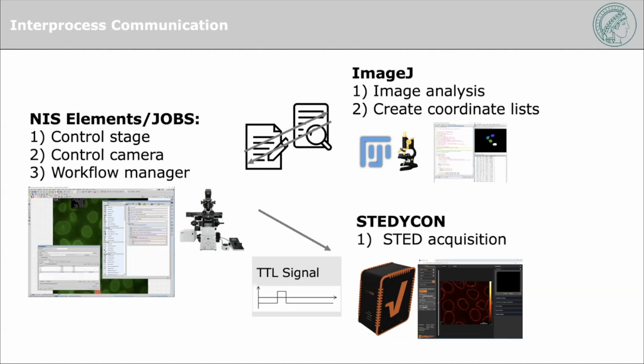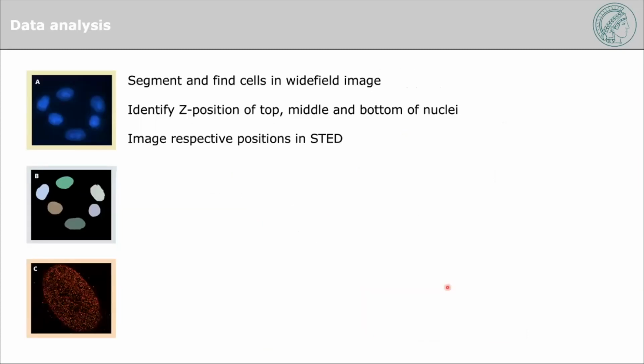So you see that basically we are not doing anything special to the system, but suddenly we are able to go from a system that came without even multiposition. Now it has changed, but in the original version there was no multiposition, to a system where we can do a lot of acquisition. So the data analysis was very simple.